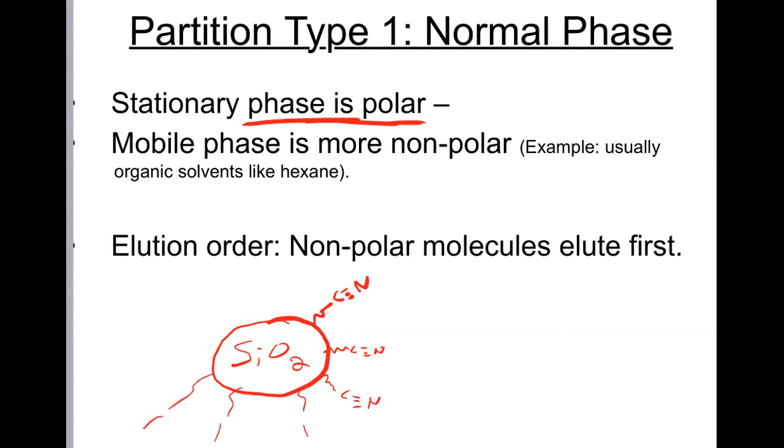Now this is chemically bonded or fixed to the silica, so they won't come off. Sometimes that's called a bonded phase. But by having the cyano group right here at the tip, that is a polar functional group, and it imparts a polarity then to my stationary phase. Now remember, this is just one bead. Inside my column, I would have packed billions of these beads, right?